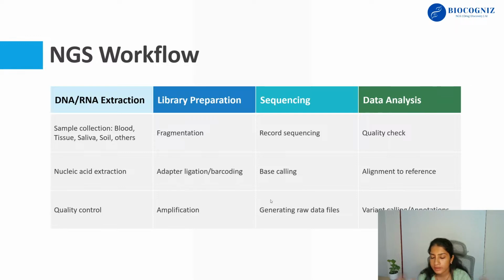After all the DNA or the genetic material is processed, we load the sample onto our flow cell, that's an equipment on the sequencing machine. So we load the samples onto that, and that flow cell is inserted into the sequencing machine in order to get the information of what bases are present in the DNA sample we are analyzing.